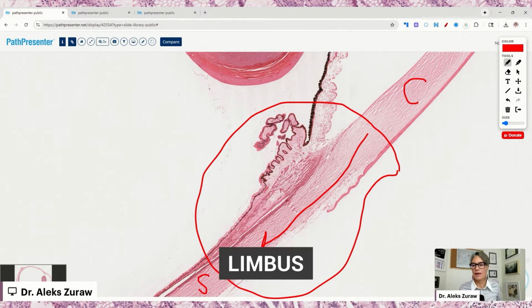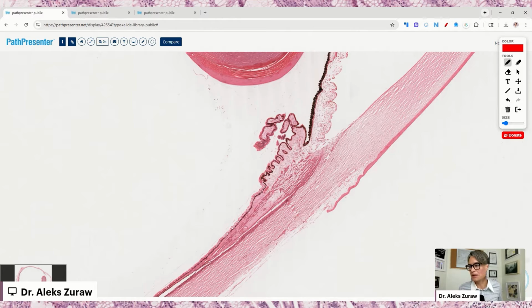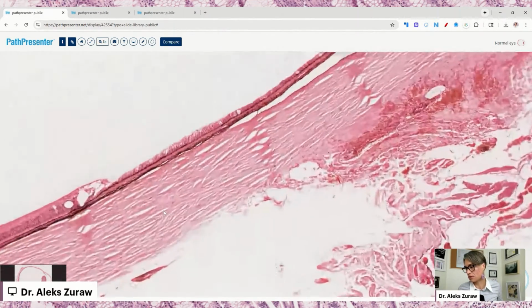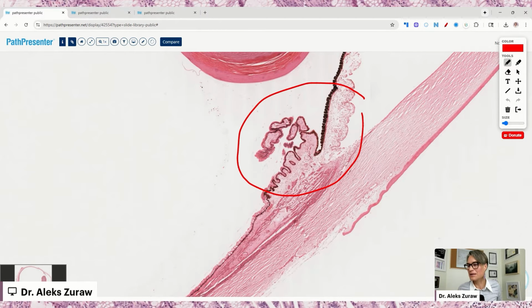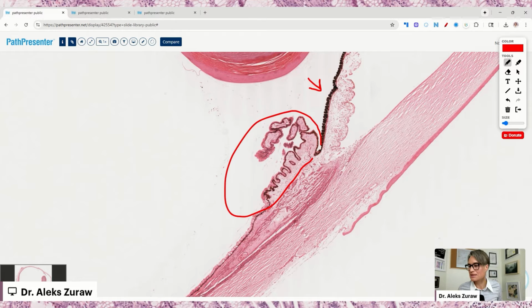We have the ordered collagen, and this is supposed to be a little bit less ordered. Honestly, to me, it's ordered as well, but maybe somehow it is not. But obviously, we have other stuff here on this limbus, on this border. We have all this stuff, and this particular thing is the iris, and this thing here is the ciliary body. Here, no, actually, it extends here.